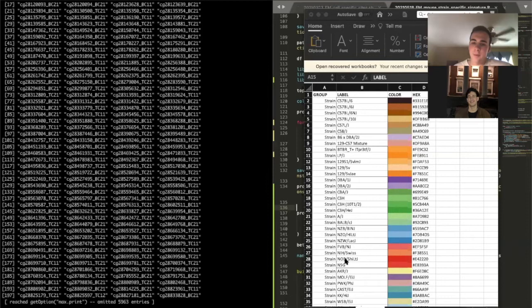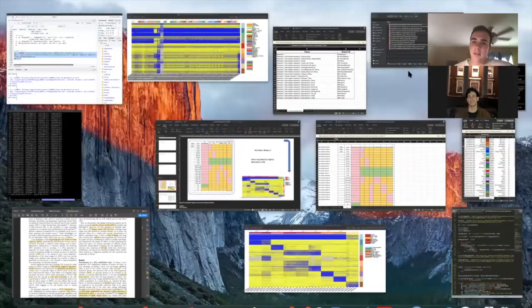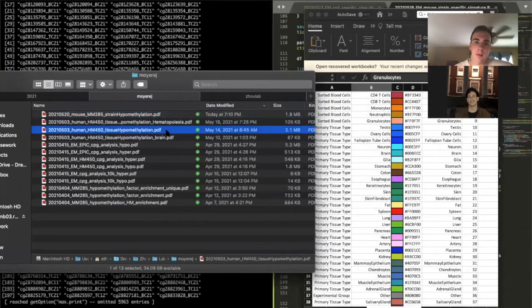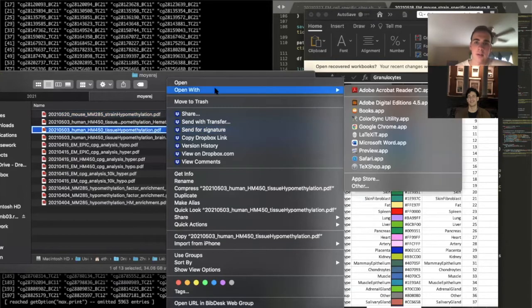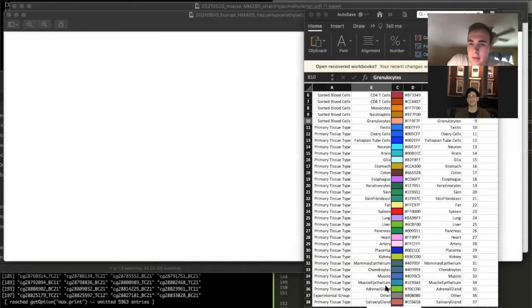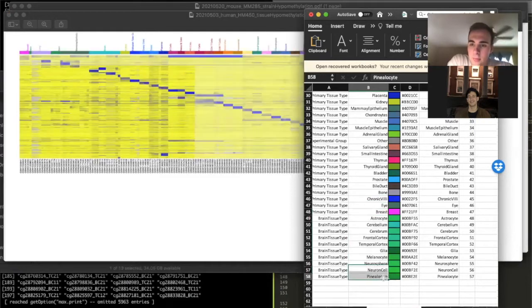Right here, I'm on strain right now. But right here, I did this only because I needed tissue colors for my plot. That's the only reason I did it. And you'll notice down here they're kind of ambiguous. Like I made the brain just all shades of green. So are you doing something else?